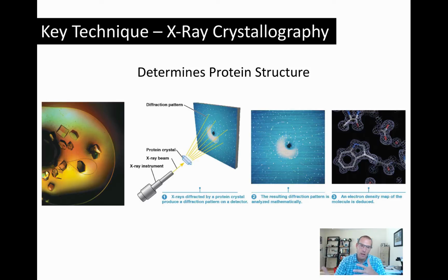This is partly some biochemistry in terms of purifying the protein and making the crystals, but then it's a lot of bioinformatics and computational biology to actually do the analysis and build the models. Incidentally, the same approach was used by Rosalind Franklin to deduce the structure of the double helix when she was working with Crick and Watson.